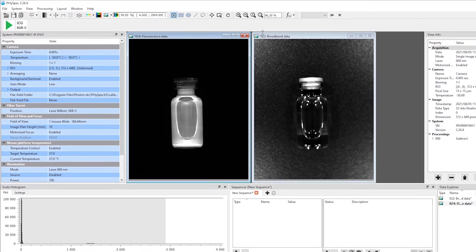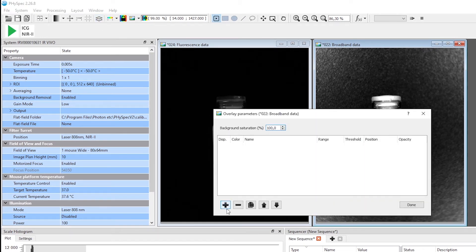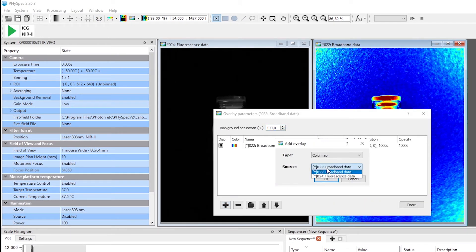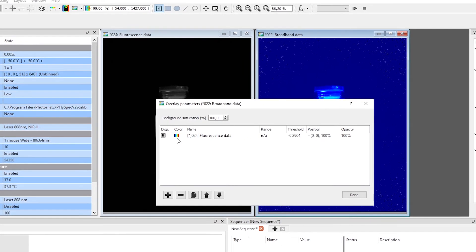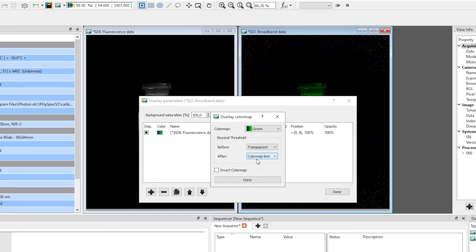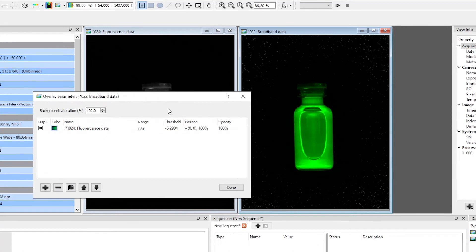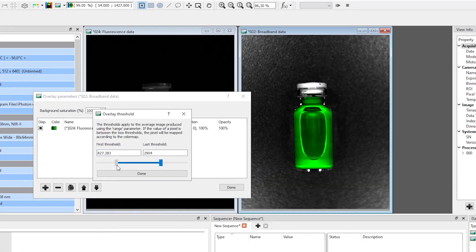Now, I will create the final image by overlaying the fluorescent image over the broadband one. Let's set the color map to green to match the ICG. Finally, we can adjust the overlay threshold to set the desired level of intensity. This way, you could visualize the fluorescence of ICG superimposed over the image of the injected mouse.